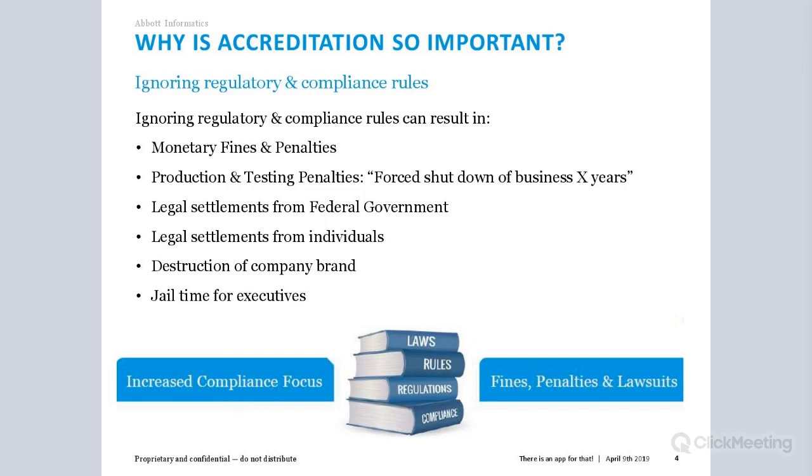So let's say a business releases a product for consumer use that was not safe due to using personnel that were not competently trained in the testing they were performing. So they needed maybe, say, specialist HPLC training, and they didn't do the training, but they performed the test. The ramifications of this oversight could be immense.